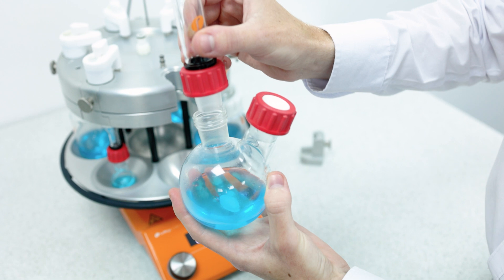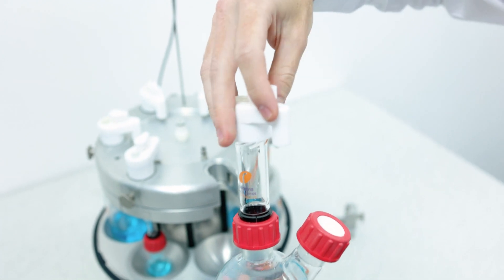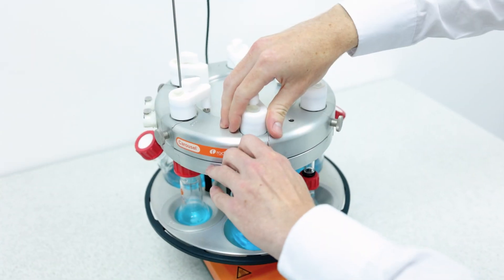It's just a matter of placing in the insert if required, connecting the reflux tube with the twist-fit connection, a quarter turn to connect the easy-on cap, and placing into the system. You can also turn the base to get easy access to each reaction position.